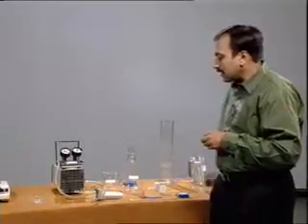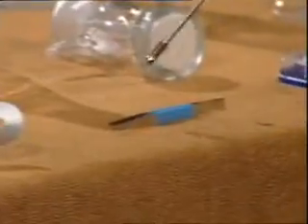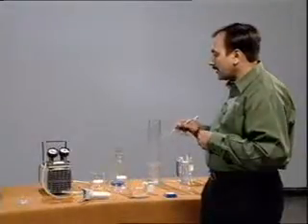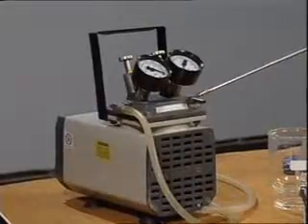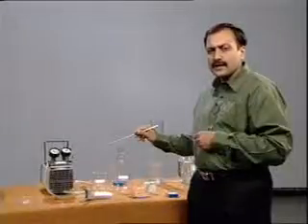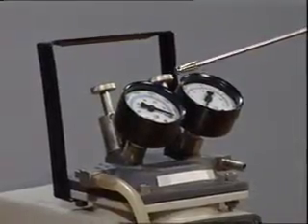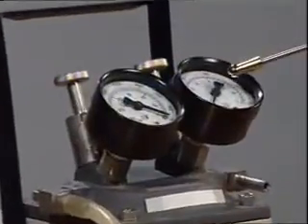We also need a clamp for joining them together and forceps to hold the filter. In addition, we have a suction pump which is free from vibrations and also noise. The pressure can be increased or decreased using these knobs and the measurement is displayed here.